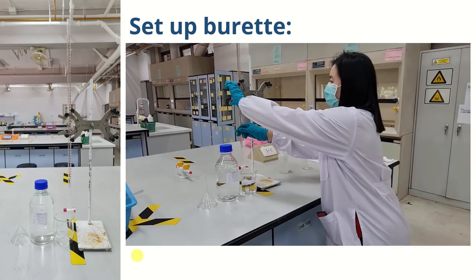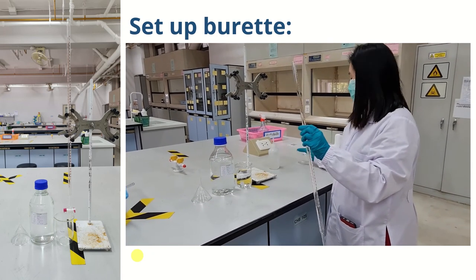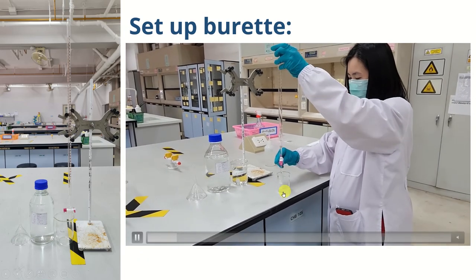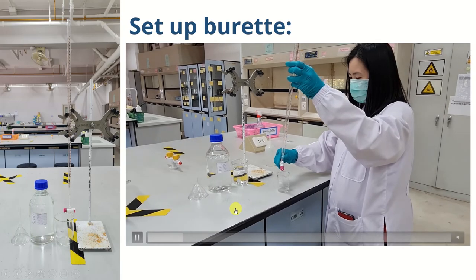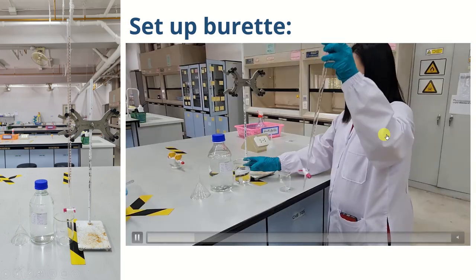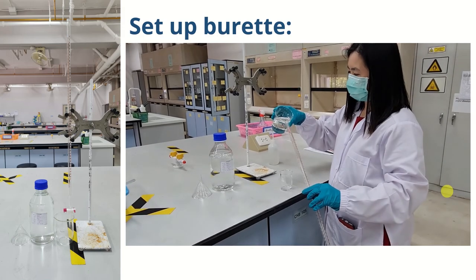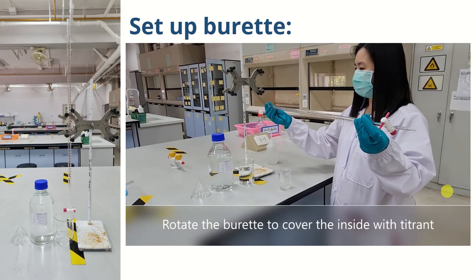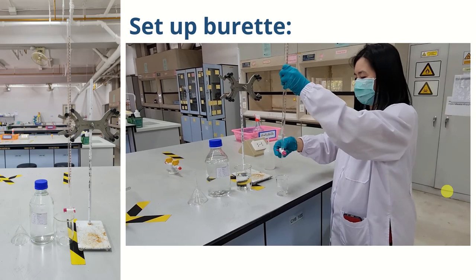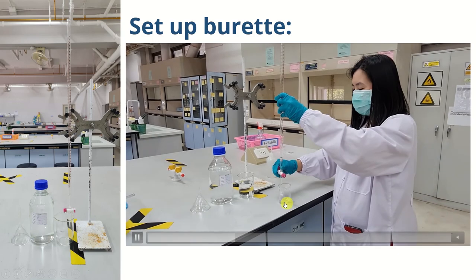Rinse the burette with distilled water first. Take it off the stand. Add some distilled water and then drain it away in the waste beaker. After distilled water, you rinse it again with the titrant. This time we use sodium hydroxide, so add small amount of sodium hydroxide in. And rotate the burette to cover the inside of the burette with the titrant and also drain it away. This is the waste now.